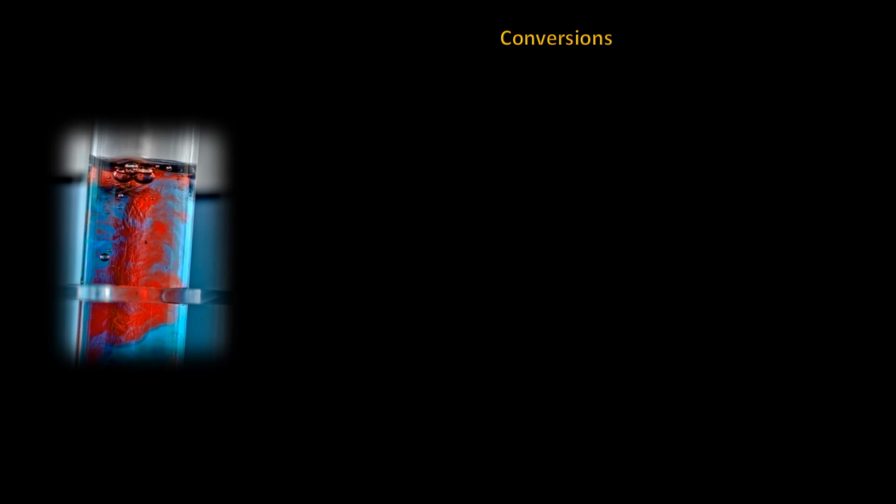The picture shown represents a conversion of one species to another. It is only a representation. However, the concentration of a species may need to be known. There are many times that a sample will need to be converted to something else to be able to obtain a gravimetric factor. The barium sulfate will be the case example.